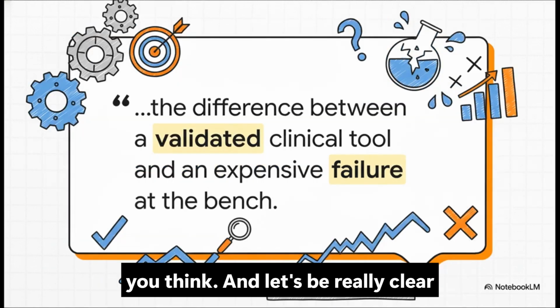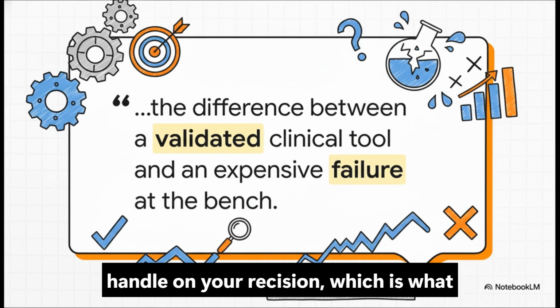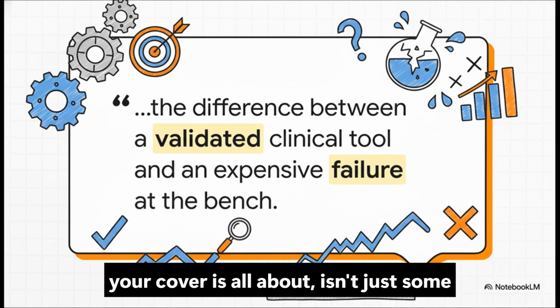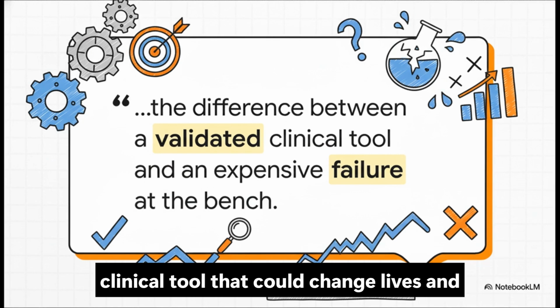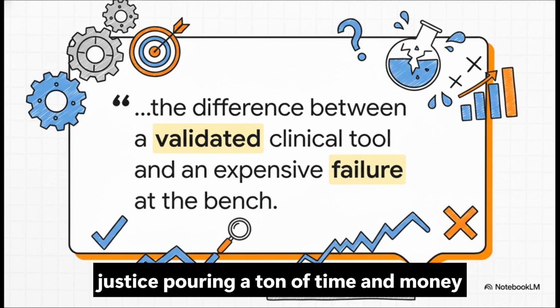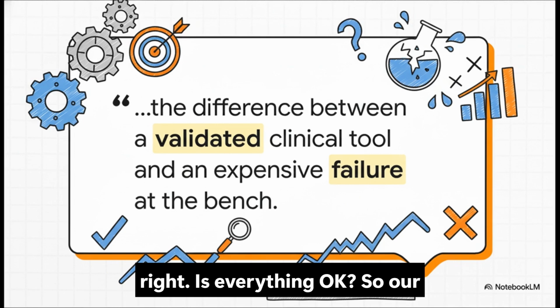And let's be really clear about what's at stake here. Getting a handle on your precision, which is what your CV is all about, isn't just some academic exercise. It is literally the difference between creating a validated clinical tool that could change lives and just pouring a ton of time and money into an expensive failure. Getting this right is everything.